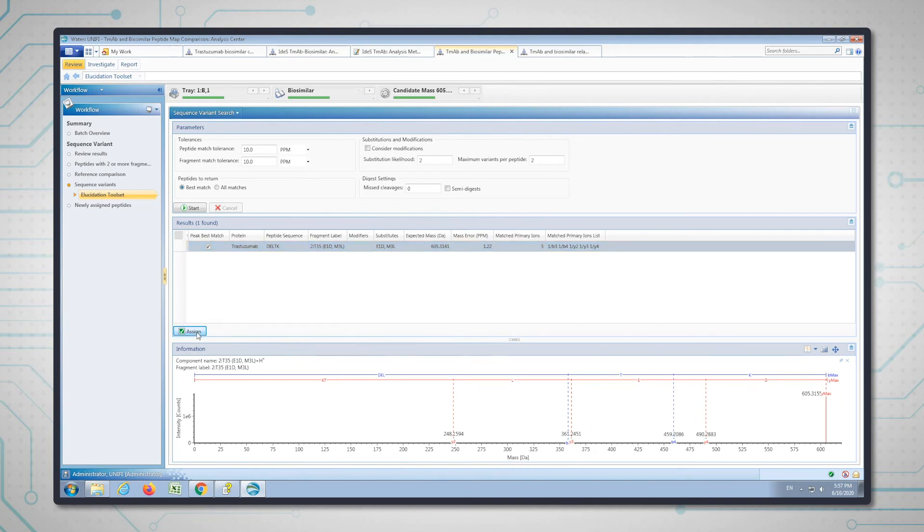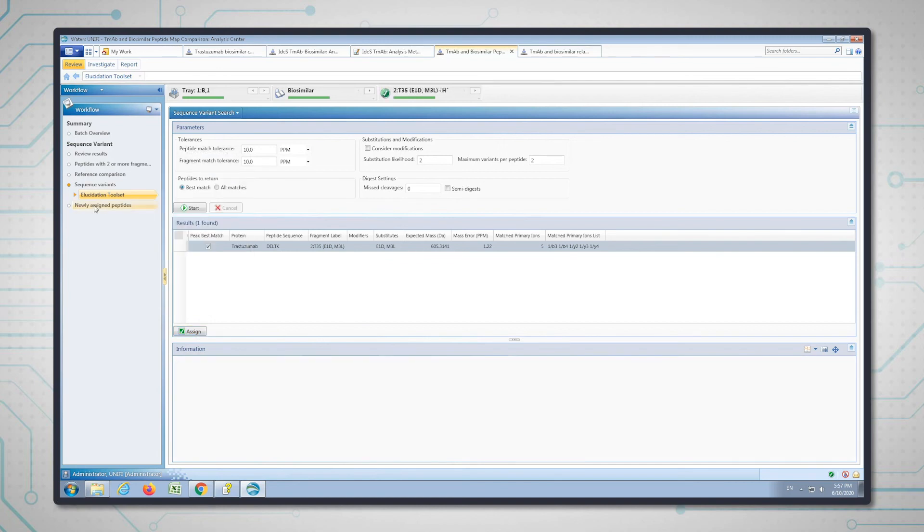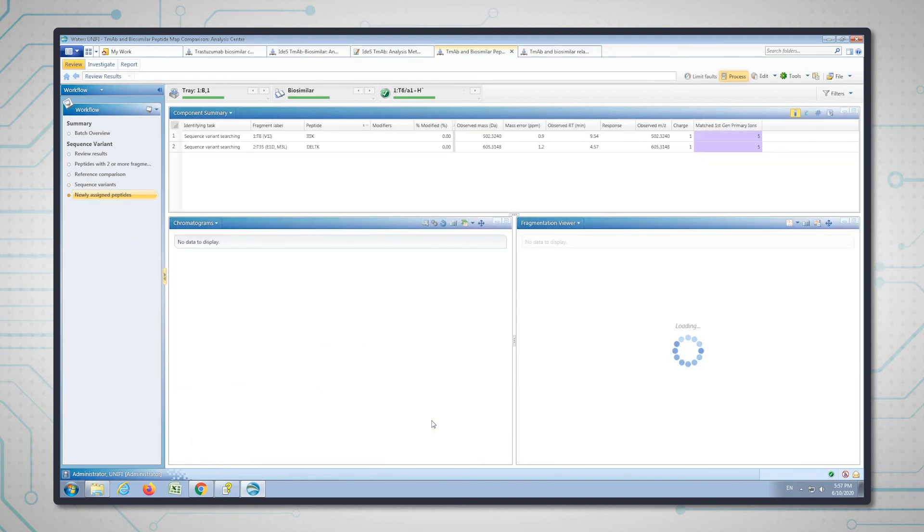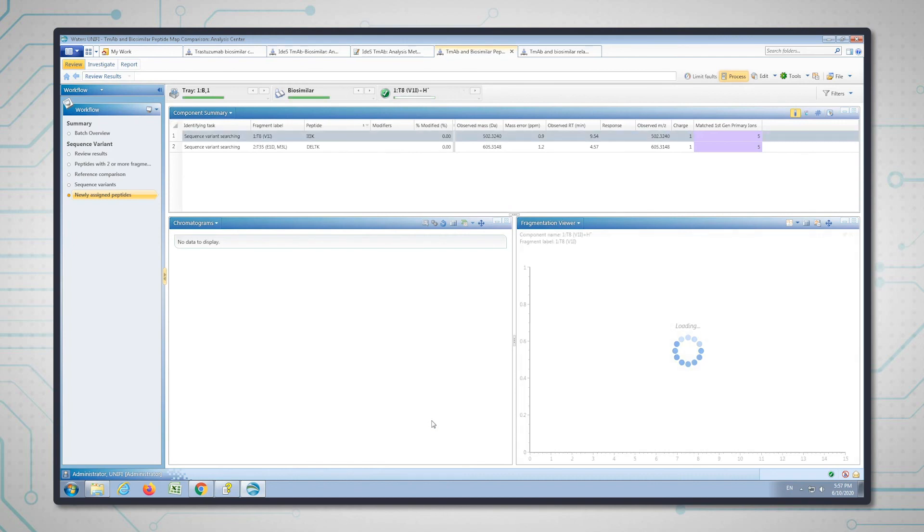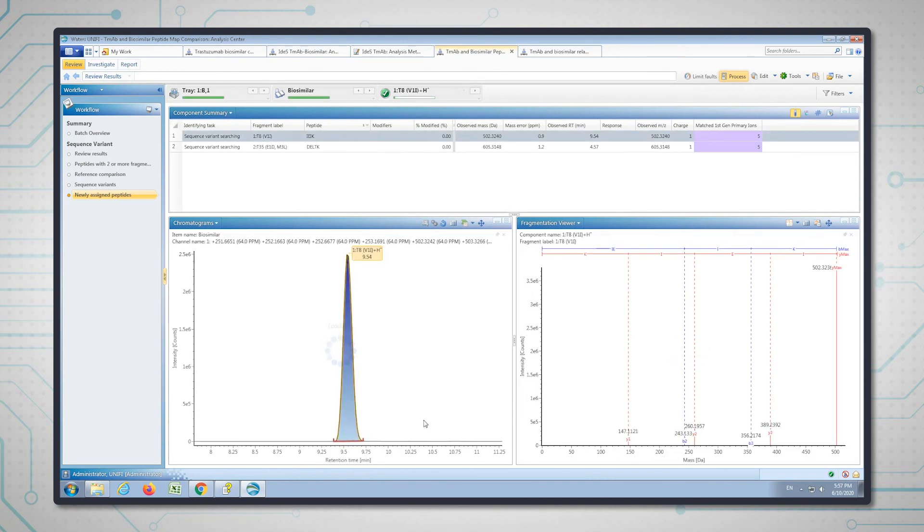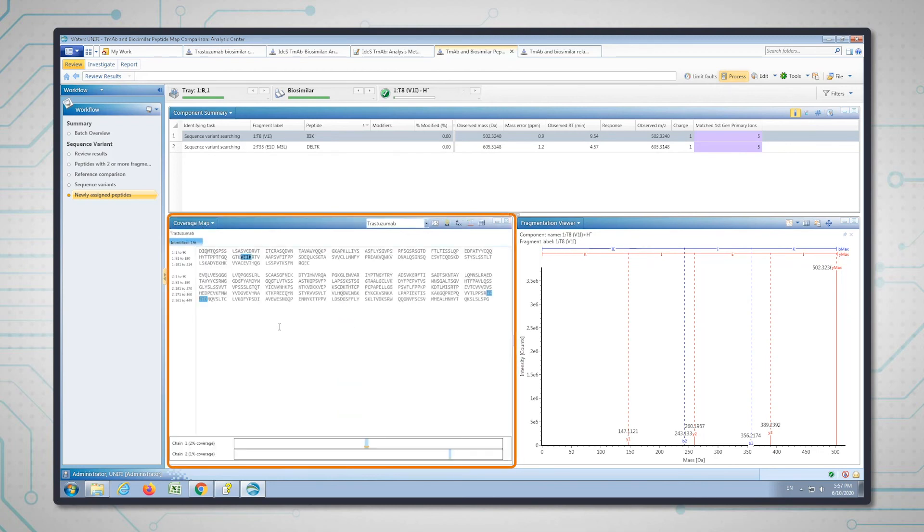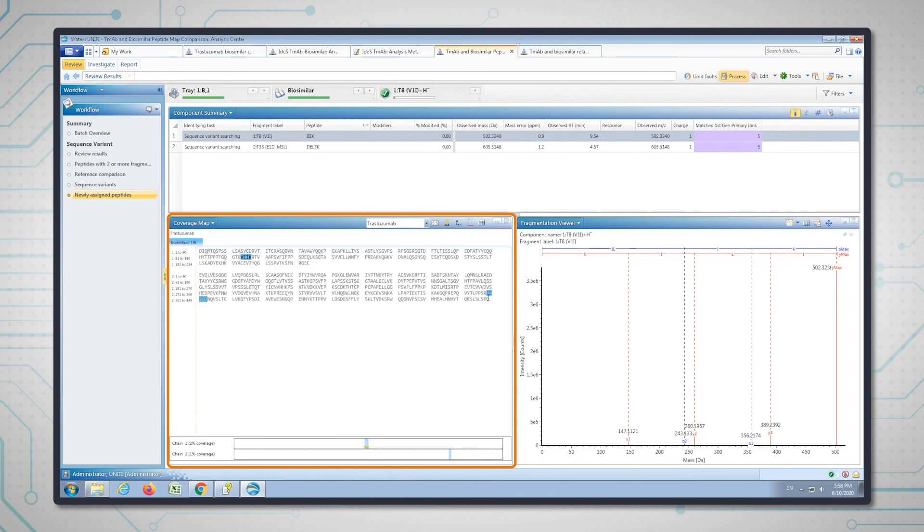Now we can go to the final workflow step, which is newly assigned peptides. Now we've put a filter on to show the peptides that have been identified by the sequence variant search. If you look at the coverage map, you can now see that we have a sequence variant on the light chain and the sequence variant on that region of the heavy chain that we saw in the previous analysis. These are the actual three amino acids—we have two amino acids on the heavy chain in one tryptic peptide and we have one in the light chain. The whole molecule has just these three differences in amino acids.